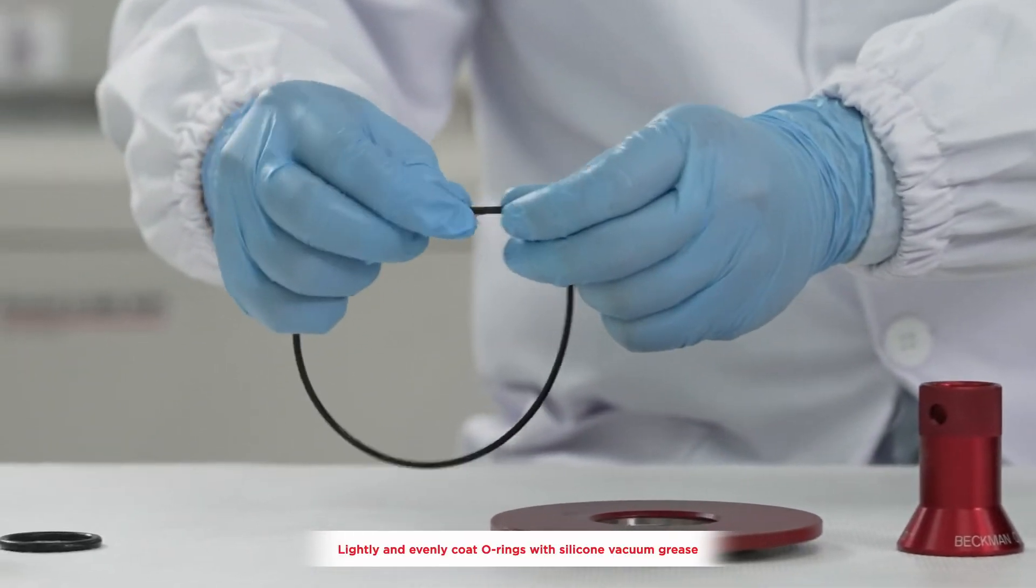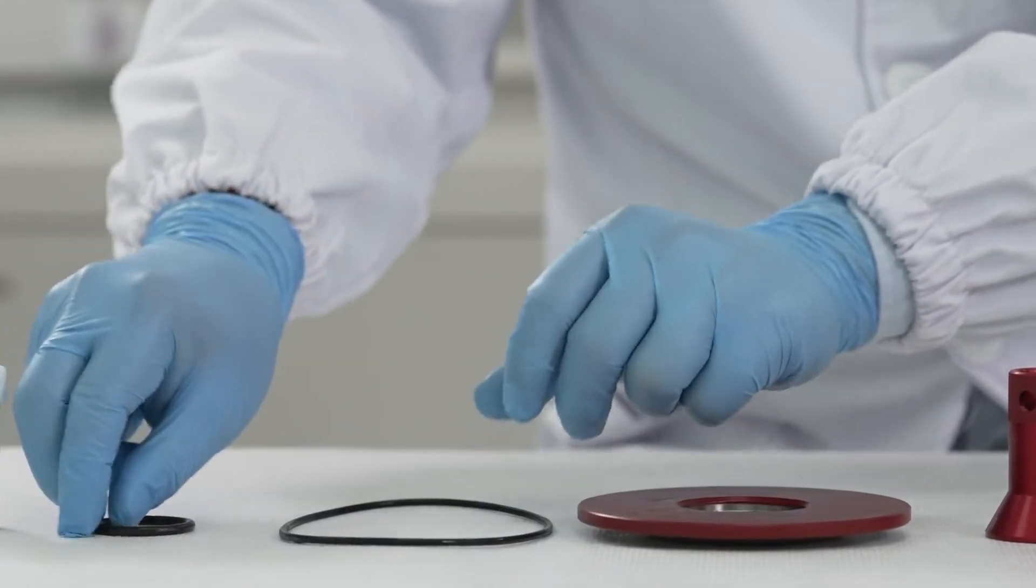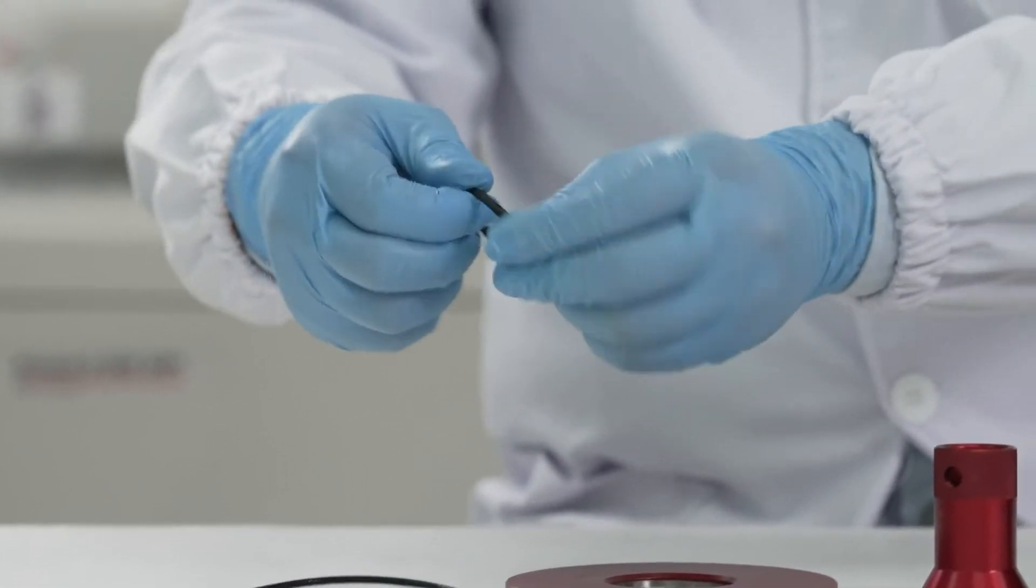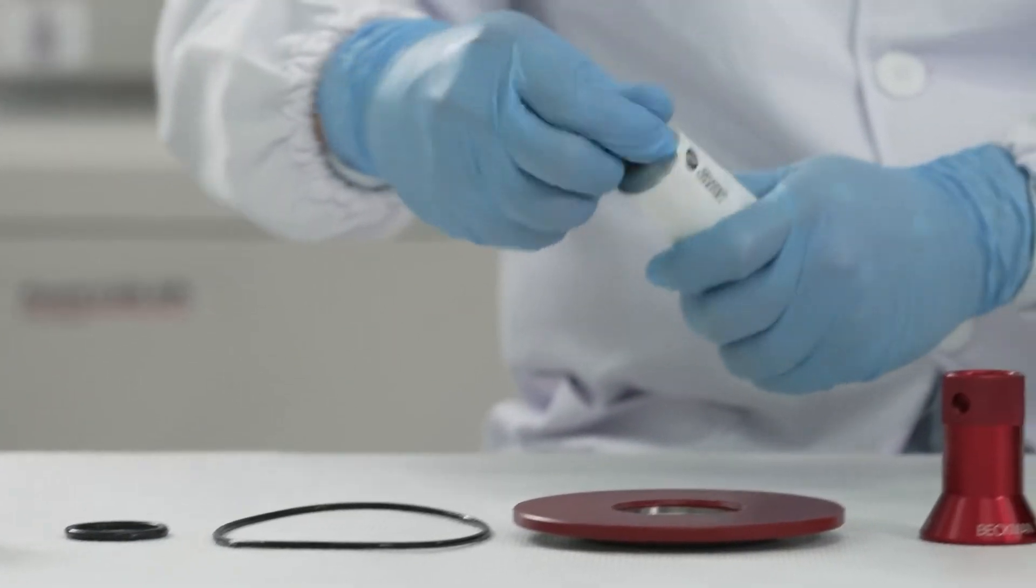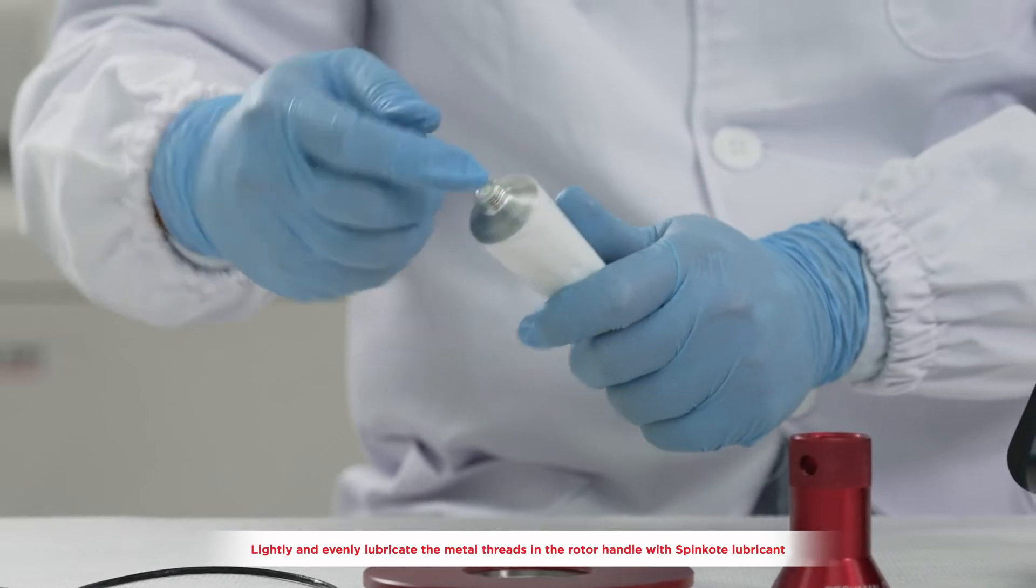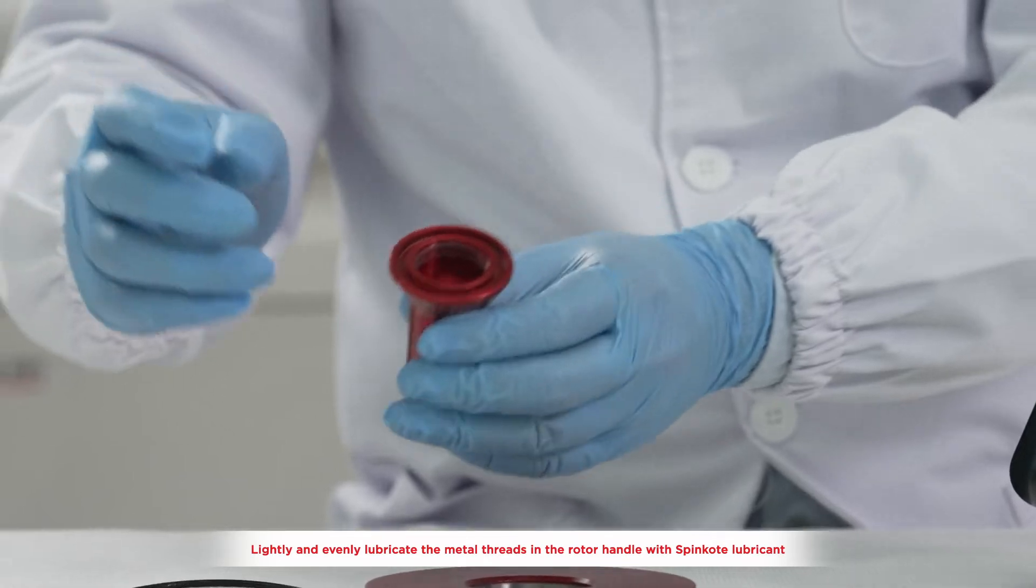Lightly and evenly coat o-rings with silicone vacuum grease. Then lightly and evenly lubricate the metal threads in the rotor handle with spin coat lubricant.